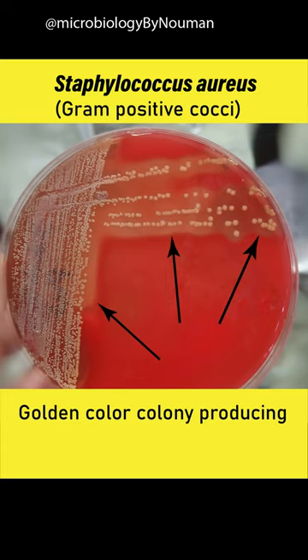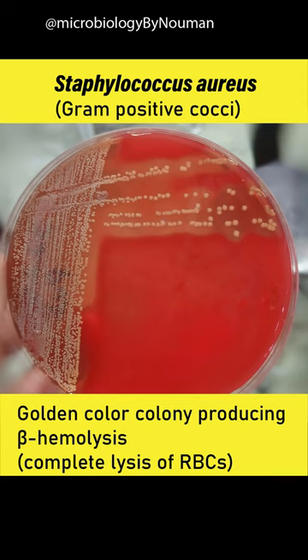The golden color colony is a big indicator of Staphylococcus aureus growth on a culture media plate. Staphylococcus aureus also produces beta hemolysis, which means they completely lyse red blood cells around their colonies and produce a clear zone of hemolysis.